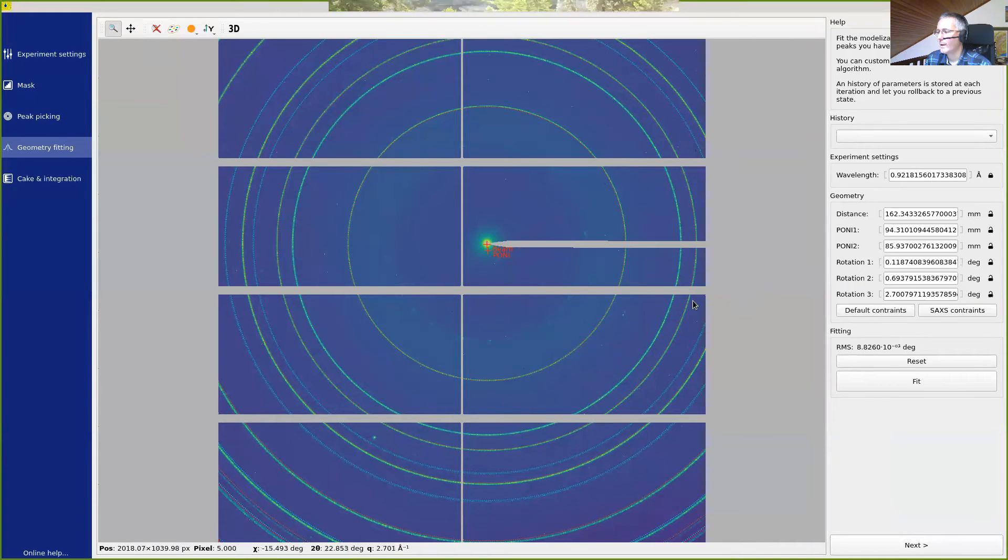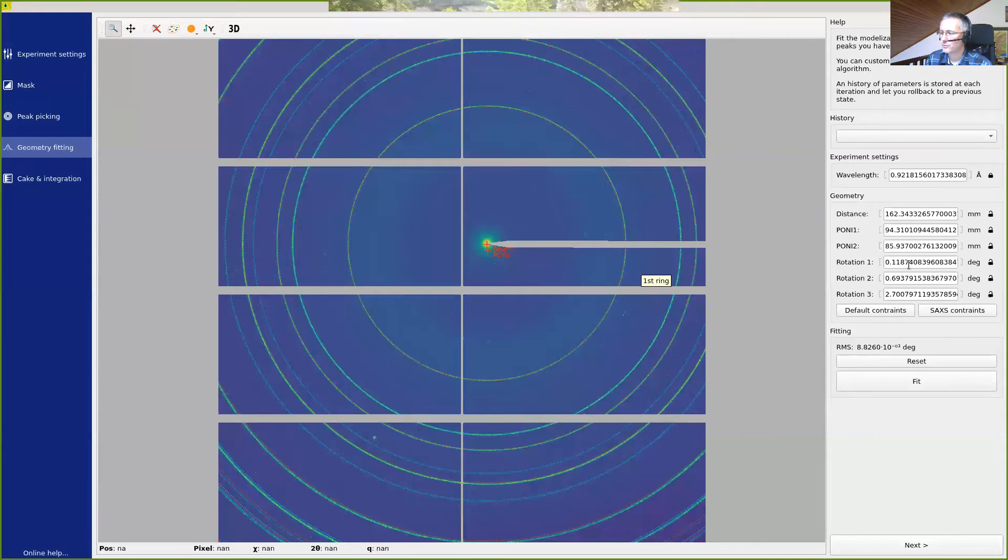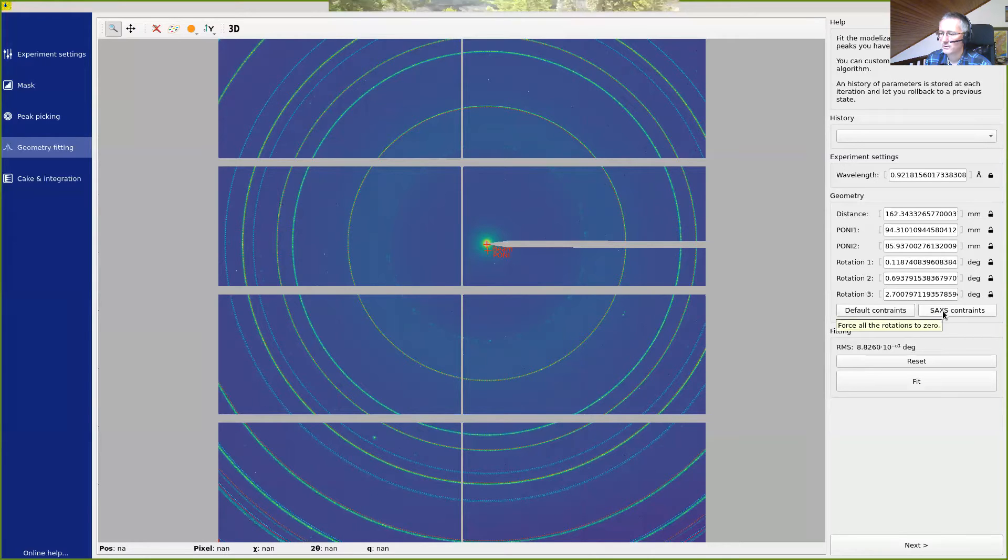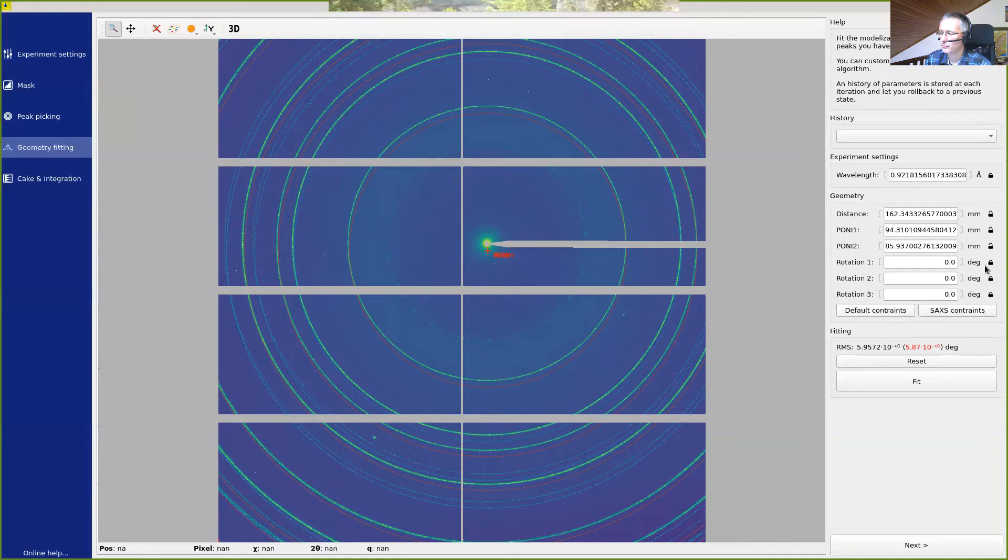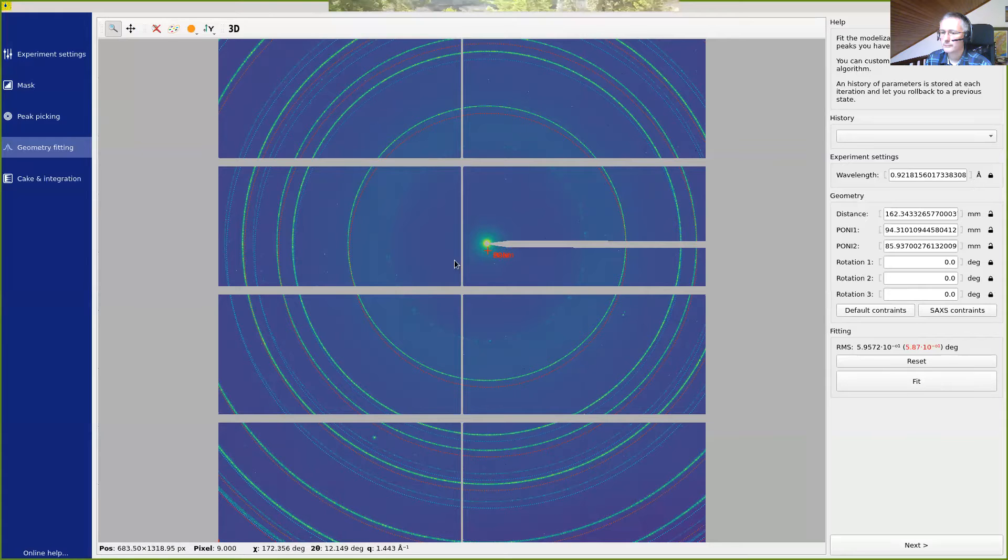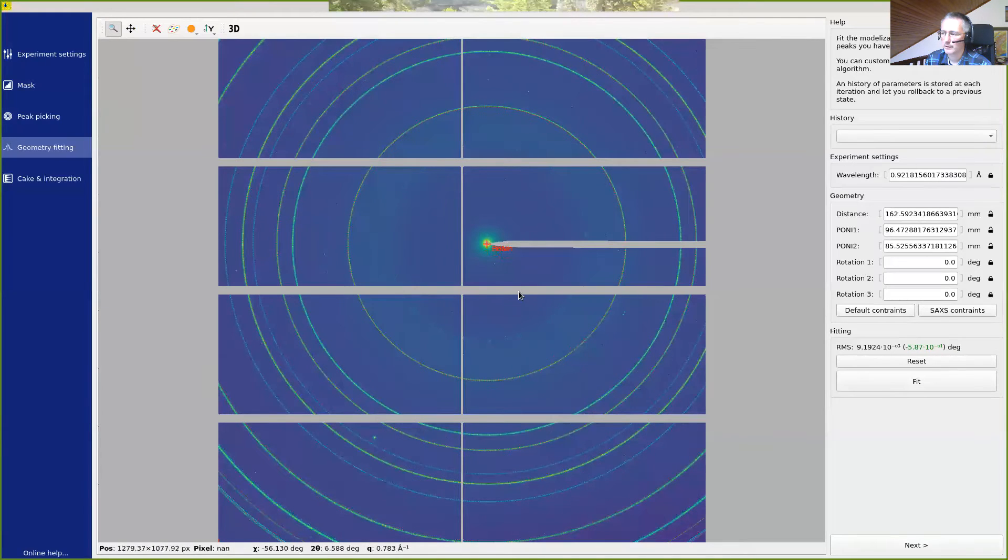One may want to tune some parameters. For example, here we have the detector, which is mounted orthogonal to the incident beam. So usually we'd like to have rotation one, two, and three set to zero. This can be done by using the SAXS constraints. By pressing this button, we have all three values set to zero. We can see here that the lock has been closed, saying that those parameters are now fixed, like the wavelengths. And we can fit again to get better matching. So we have the same matching back again.